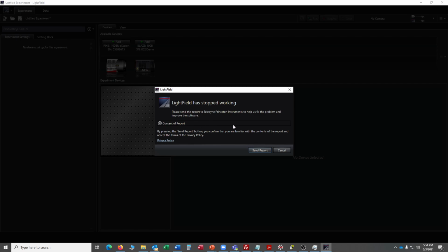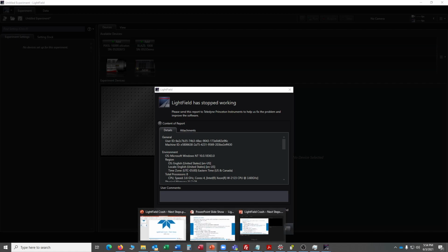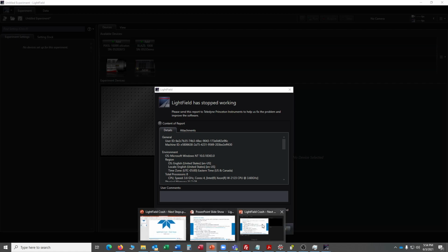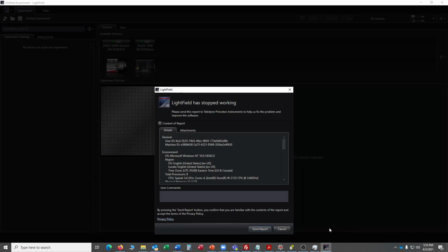So now LightField crashed, right? Oh no, what do I do? Well, I've gone through all of these, right? Oops, my presentation went away. Where did my presentation go? This. Yep, I went through all these steps. I still can't resolve the crash. Well, now I'm going to obtain the event log.